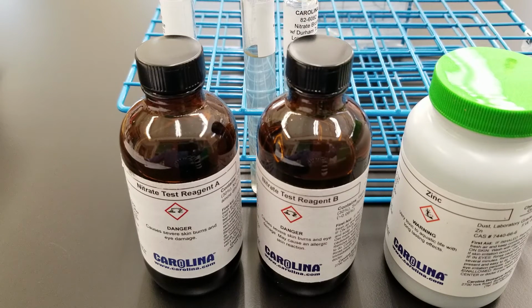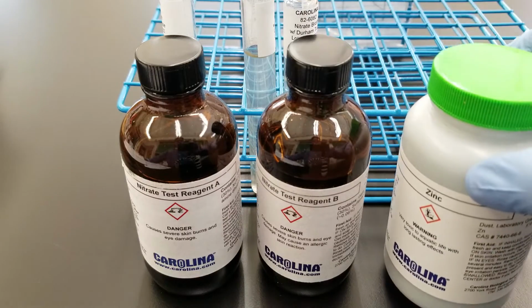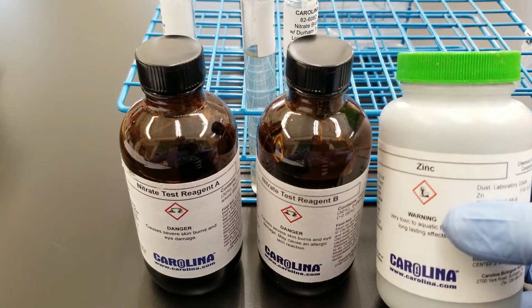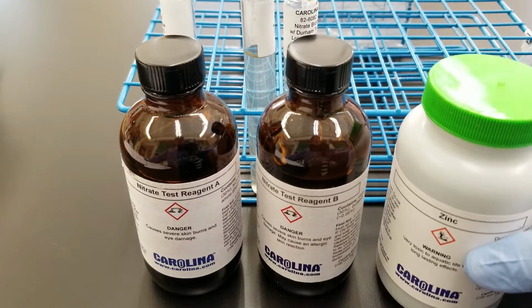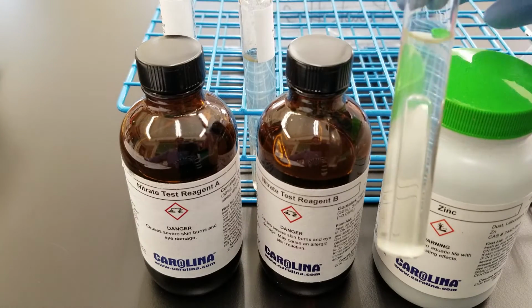So to figure out which one you have, you add the zinc dust only if there was no color produced, okay? So we want to find out, is it a true negative or is it actually a positive? It's just past the point that we expected it to go, okay? So if we add the zinc dust here and it turns red after the addition of the zinc dust, then it's a true negative, and that means the nitrate is still present in the broth, okay?